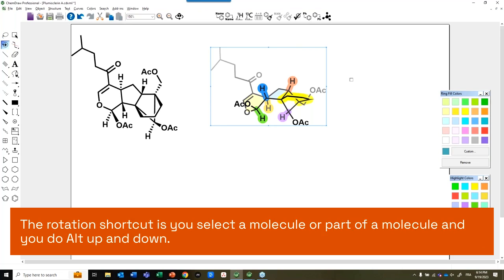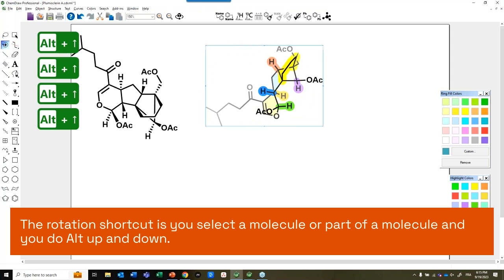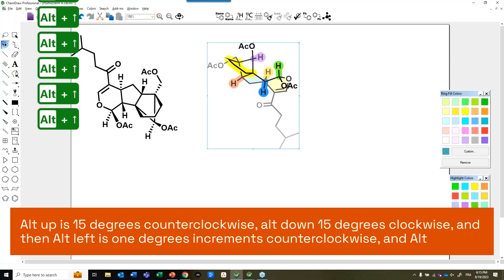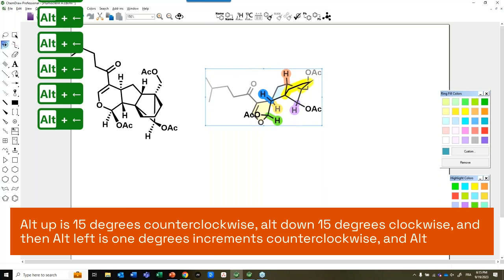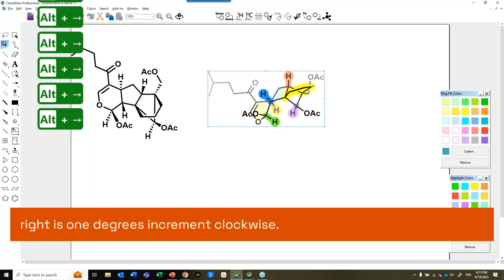The rotation shortcut is you select a molecule or part of a molecule, and you do Alt Up and Down. Alt Up is 15 degrees counterclockwise. Alt Down is 15 degrees clockwise. And then Alt Left is 1 degree increments counterclockwise, and Alt Right is 1 degree increments clockwise.